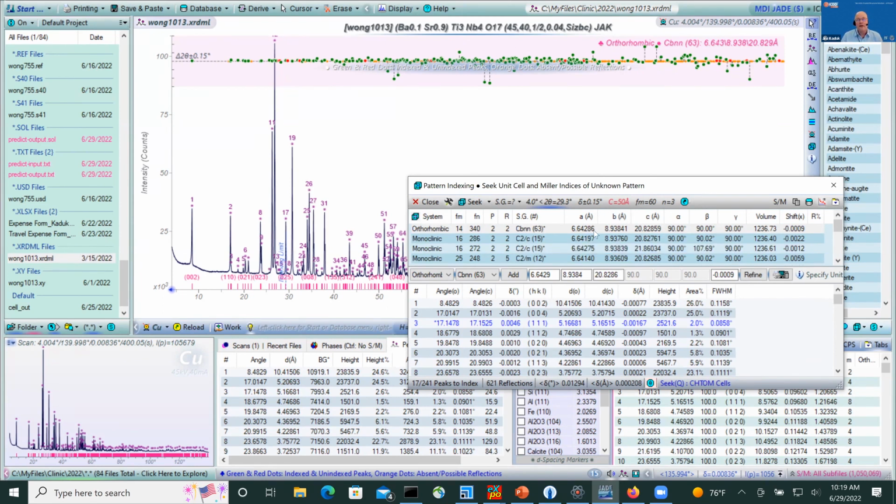But once you find a unit cell, in the Powder Diffraction File under the crystallography tab, you can search author's unit cells to do a reduced cell search and see what compounds match. Of course, before doing that, you would just do a normal search match and see if there's something suitably similar. But the cell search provides a complementary way of doing that. So in this case, Jade overcame the displacement error.